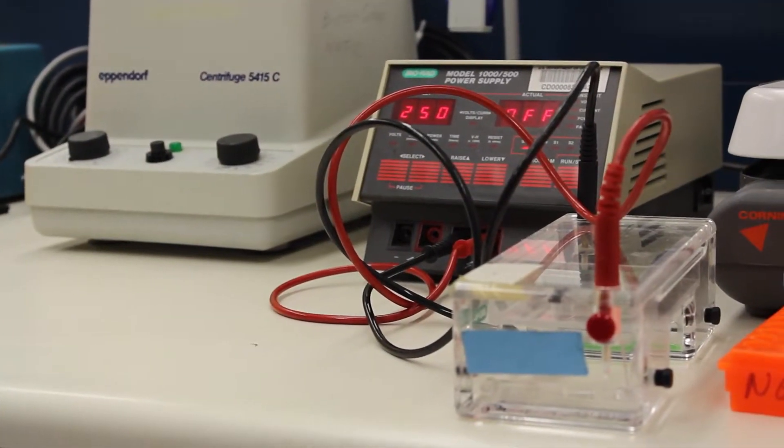After that's done, we'll run it on a gel and stain that gel. When we look at it under blue light, if that piece of DNA that we're looking for was in our sample, it'll light up as a bright little band. Then, depending on the size of that band, we'll be able to tell if that's heterosigma or not.